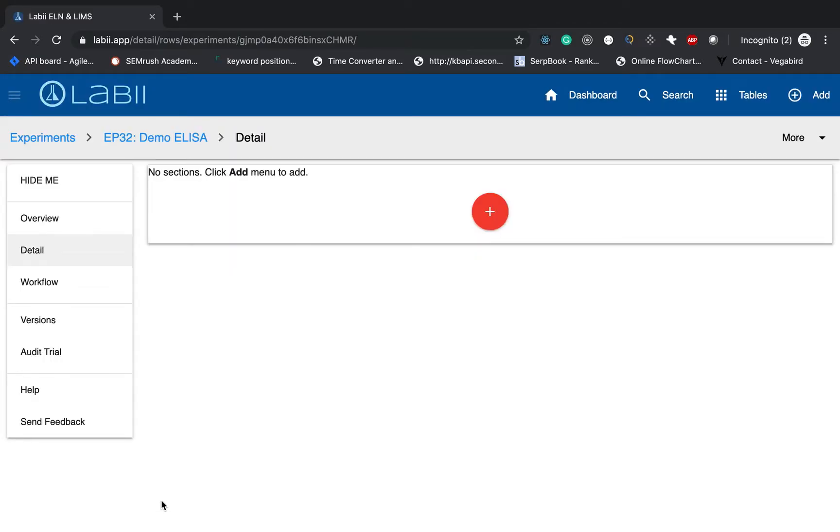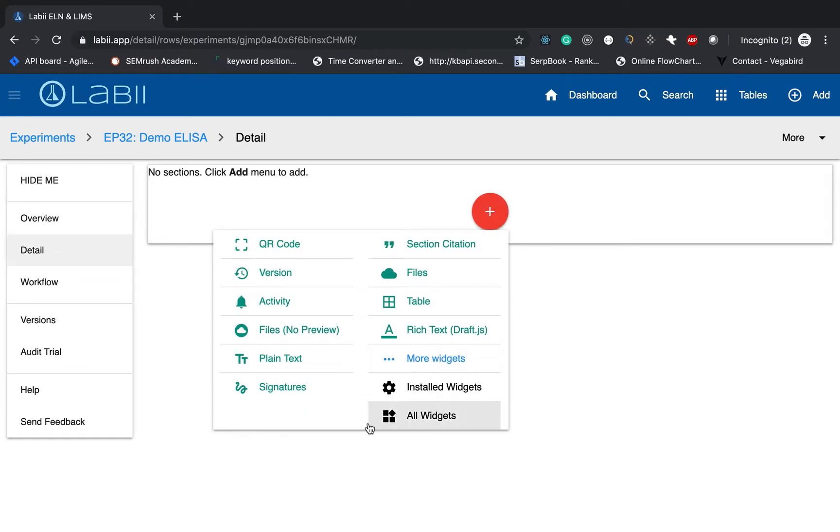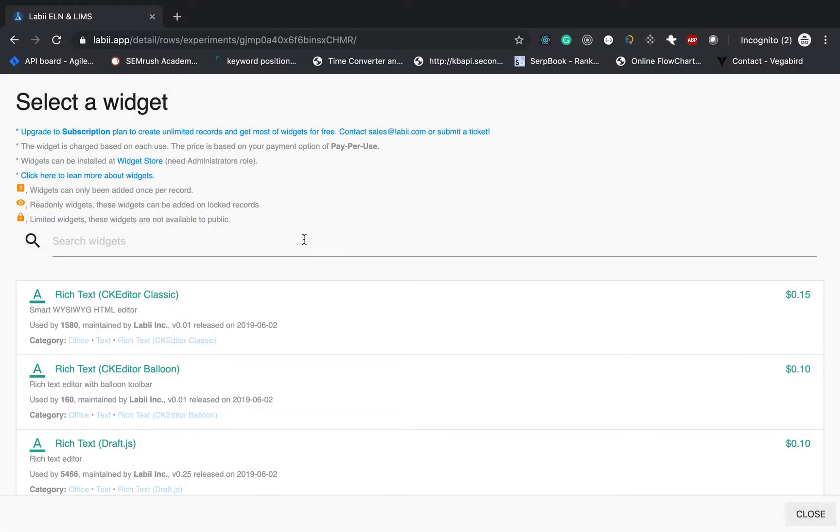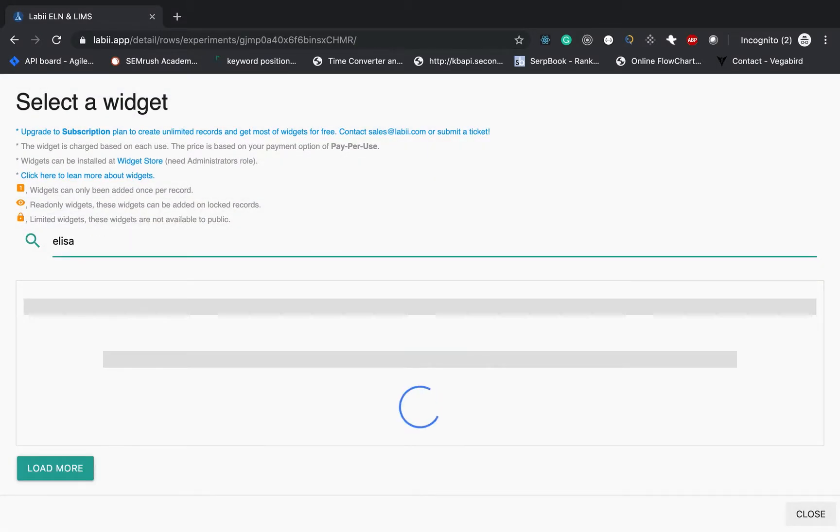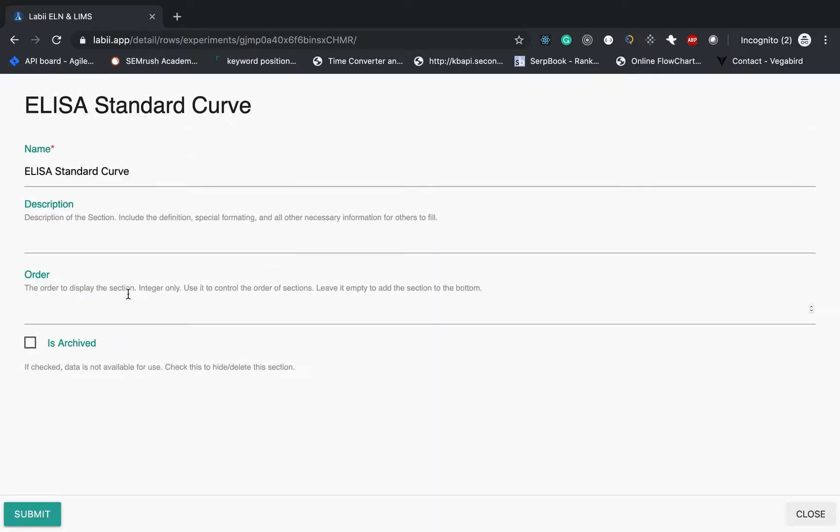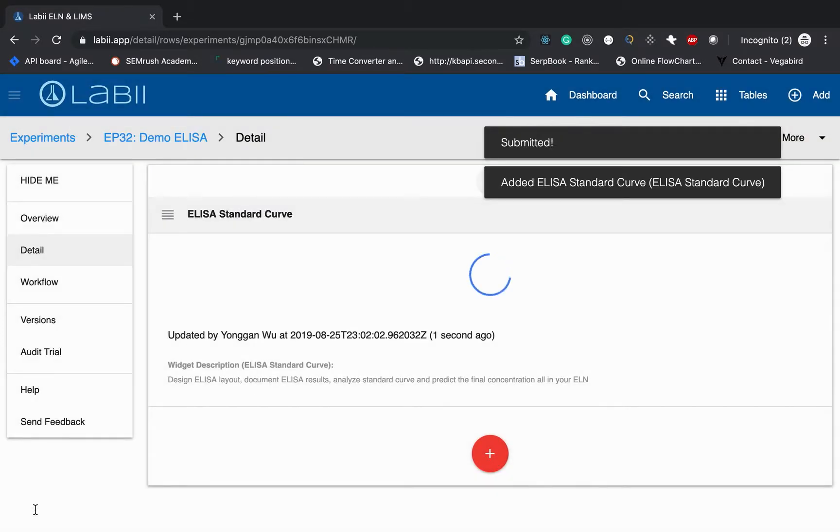Once you click submit it, an experiment will be created. And then click the add button to add a new widget. So I will choose a widget of the ELISA standard curve. If you did not see this widget, it means it is not installed. You can always go to your widget store to install this widget. Click add. The new section is being added directly.